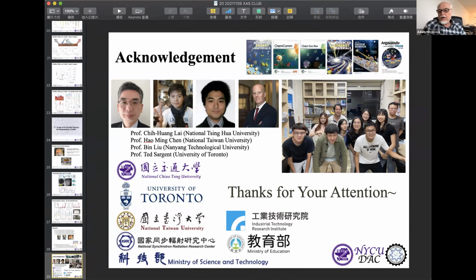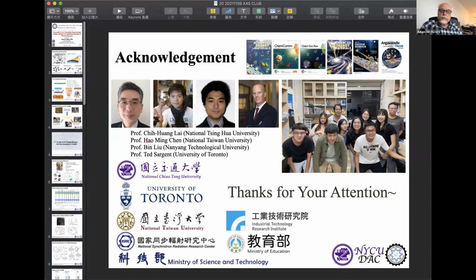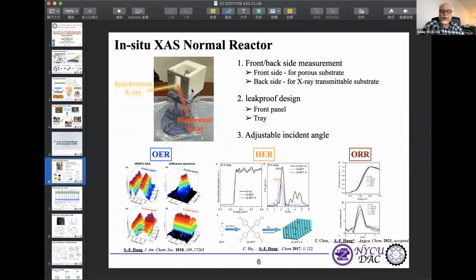Really amazing talk, amazing work, and good luck with ongoing experiments of this type. I was wondering what material you use to make the non-photocatalytic reactors, this white material that is the body of the cell? For the normal reactor? Yeah, what is that white stuff? That's PTFE for the main container. You can machine it and keep its properties so that you can tap holes in it. It's not Kel-F? Usually Teflon PTFE is not very machinable, right? Because it's a soft material.